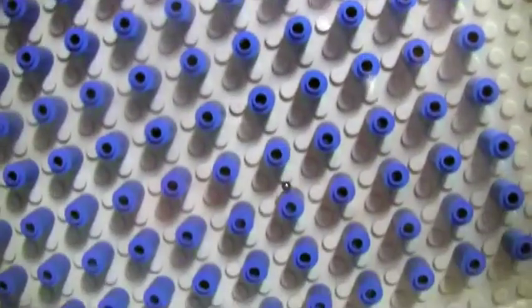The smaller spheres move more in a zig-zag motion, whereas the larger spheres tended to go down one straight column.